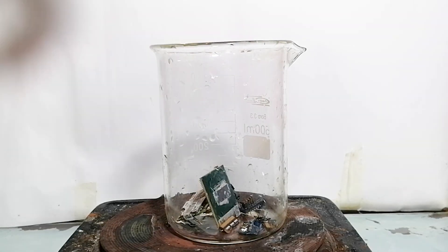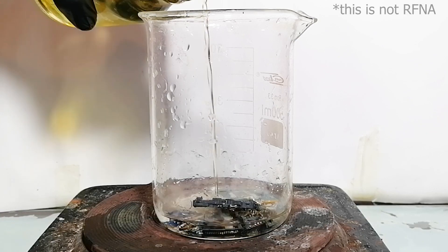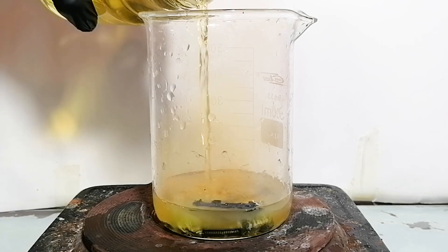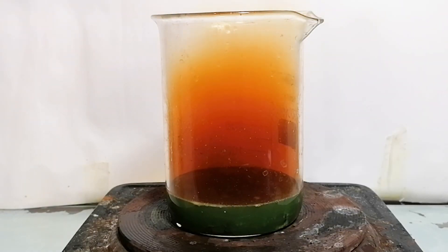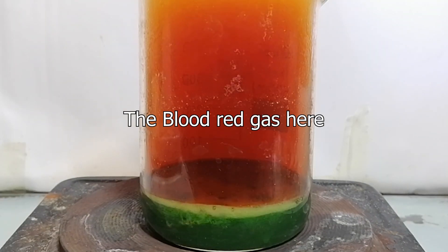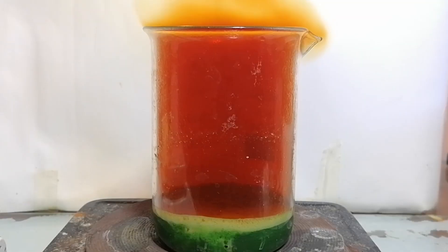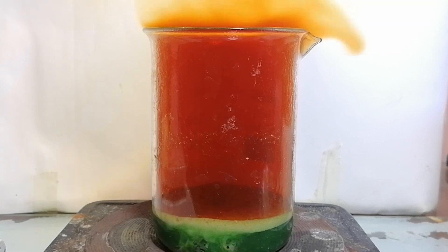I've dumped everything into a beaker and now it's time to acid wash it. Some water was added and then it was followed with a bunch of nitric acid. A reaction started occurring immediately. However, even though nitric acid is extremely powerful, it's still reacting relatively slowly. So I'll help it by turning on the heat. The blood red gas here is coming from the reaction of nitric acid dissolving some of the metals. Once the heat was turned on, the intensity of the nitric acid reaction started ramping up along with it.